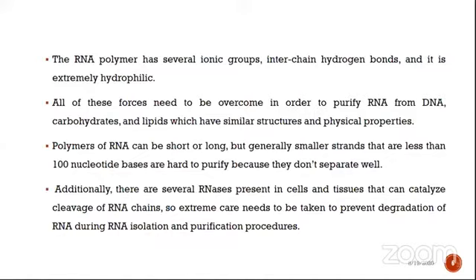So, if we want to purify or extract the RNA for our experimentation or for the diagnosis of any disease, we need to purify this RNA from DNA, carbohydrates, lipids, and other different structures and molecules. So, we need to overcome these forces, which are the several ionic groups and interchain hydrogen bonds.